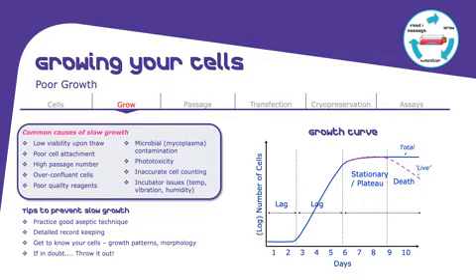Another reason to do the growth curve is that cells are very consistent, and if they have proper media, proper temperatures, and all the rest in order with all the supplements, the growth curve will repeat itself. If you suddenly notice that the cells started growing poorly, or the opposite, they start growing too fast, or they're not so viable anymore, it might be that there is some kind of issue with the cells.